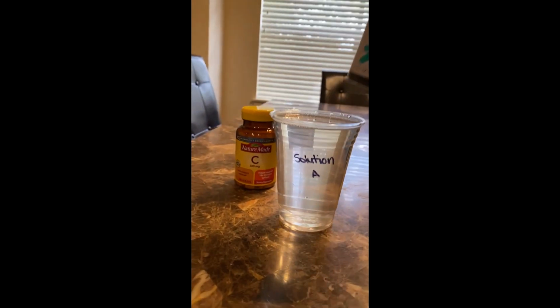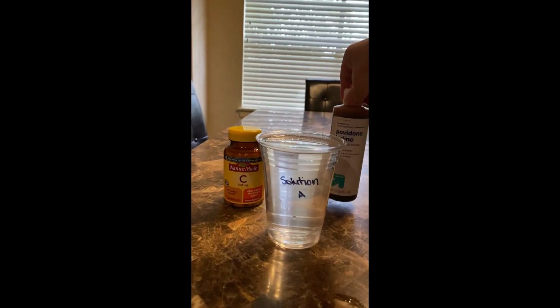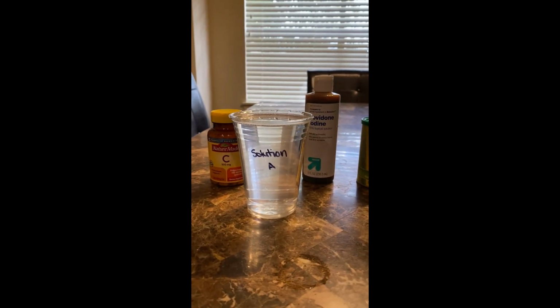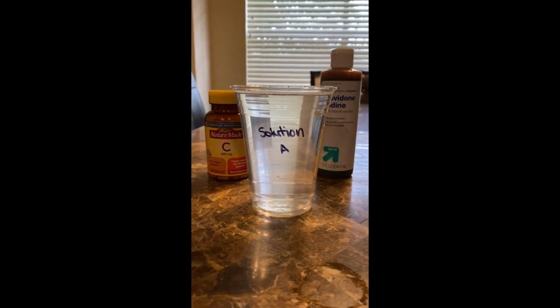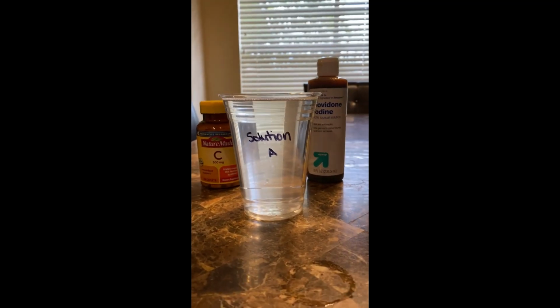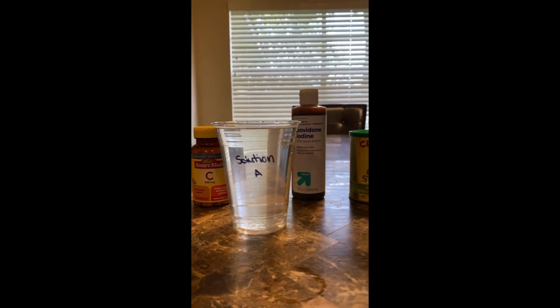All that the store had was a 10% iodine solution, so I used about 12.5 milliliters of that. It became colorless pretty instantly, so I think I had the right concentration of vitamin C to iodine, and then I added water to finish that solution.